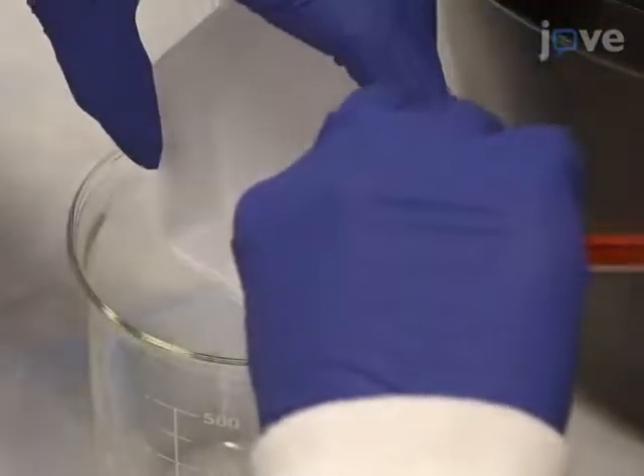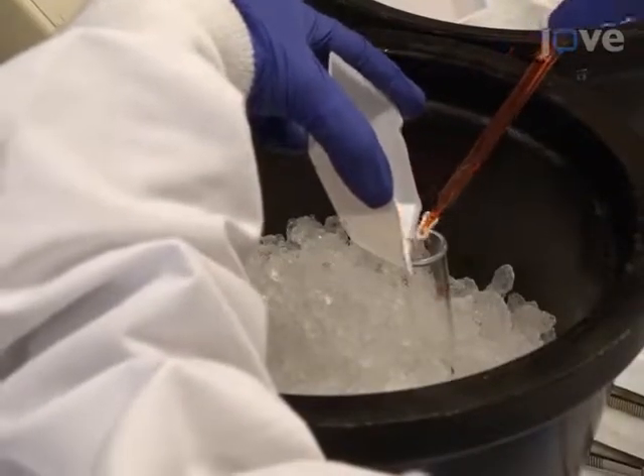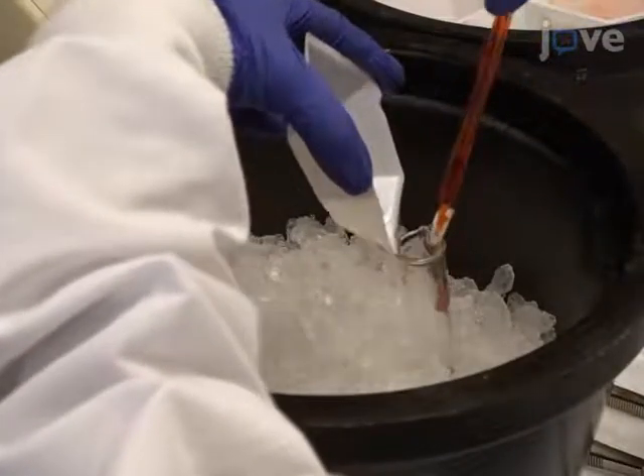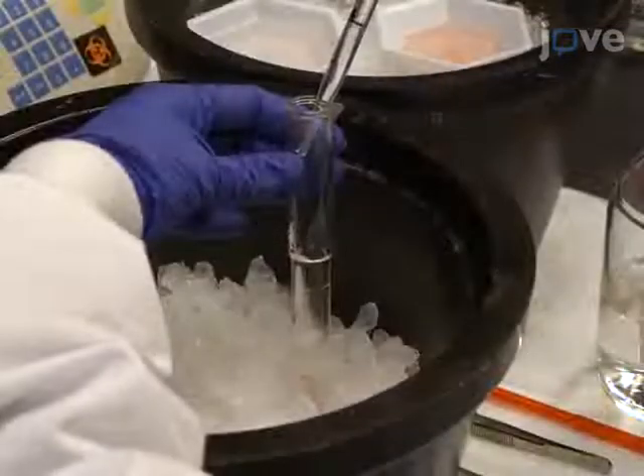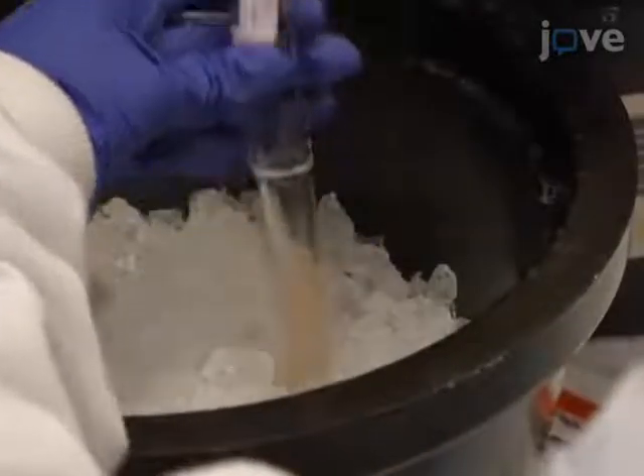Carefully discard the PBS and transfer the tissue to a pre-chilled 7 mL glass Teflon Downs homogenizer. Then add 5 mL of ice-cold MSEGTA buffer and homogenize until there are no visible tissue pieces.